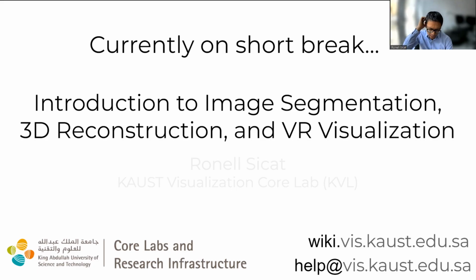While we're in the break, maybe I just say a few words or a few things that might be helpful. So as I mentioned, I think in the first part, Avizo is a commercial tool. And we have a license for Avizo here at KAUST. So you can just download it from the IT website and set up the license. So the instructions are there in the IT website. And yeah, again, unfortunately, Mac OS is currently not supported anymore. So you can either use Windows or Linux.